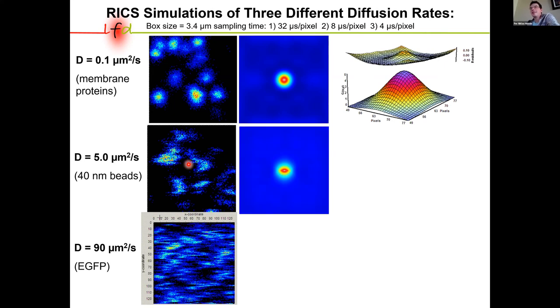If we calculate the correlation function, you will see this. It will manifest itself as a compression of the function between lines and an elongation between pixels. The reason this is happening is that now that the molecules can move, you have a higher probability to find them in pixels further away while you're scanning the line.